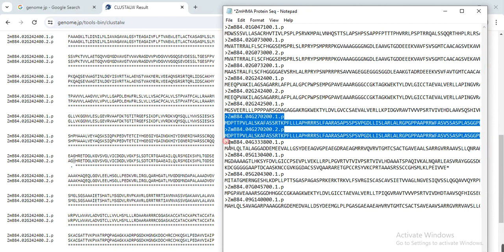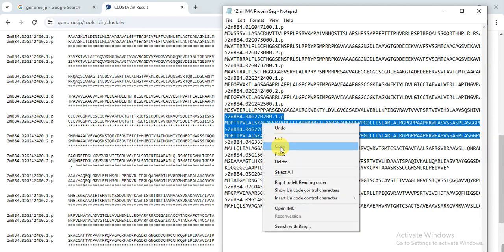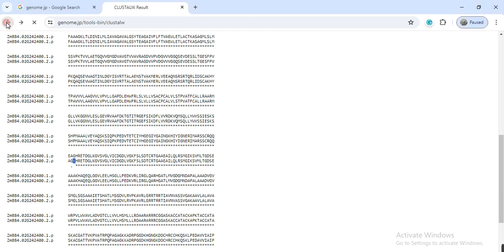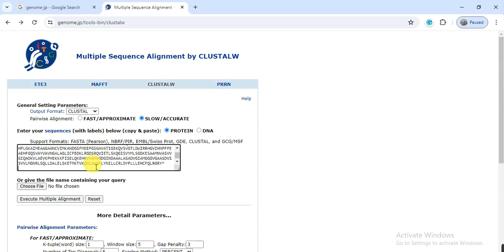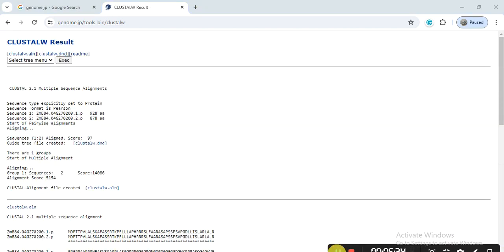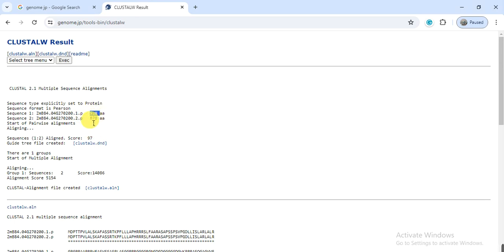We check another gene with two transcripts — copy and execute alignment. Here you can also see a difference: the amino acid counts are 928 and 927, meaning there is a difference in amino acid numbers. The sequence alignment score is 97%, which also confirms there is a difference in the sequence.